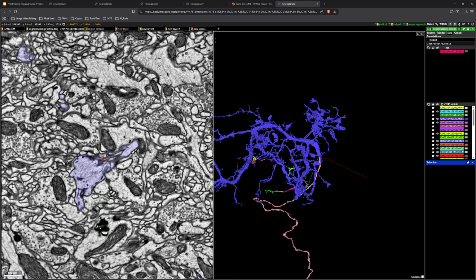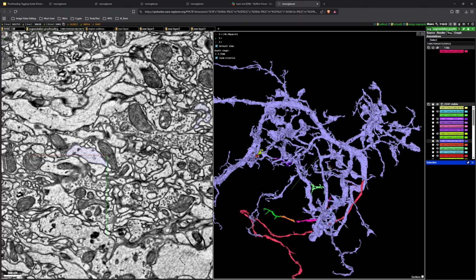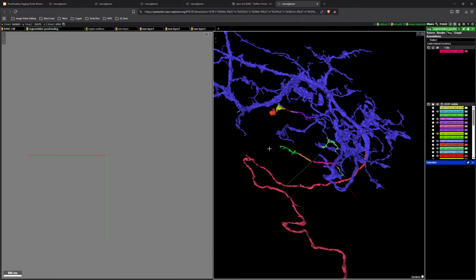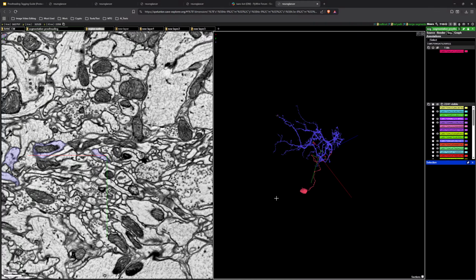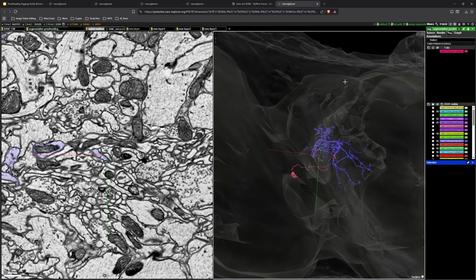All right. This appears to be a can't trace to Soma, but I believe this received a can't fix tag. Yeah, so if this happens to you, and I could see why it might, this larger, thicker extension ends here, which might make you think, oh, it probably goes on for a while over here. And if you look at the brain mesh, it's in the central brain. Things in the central brain are usually quite large.